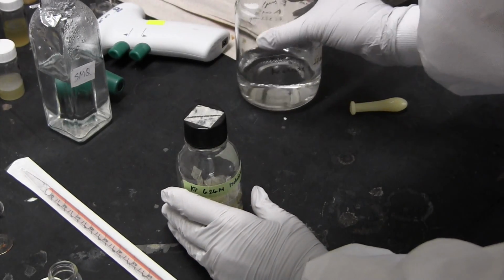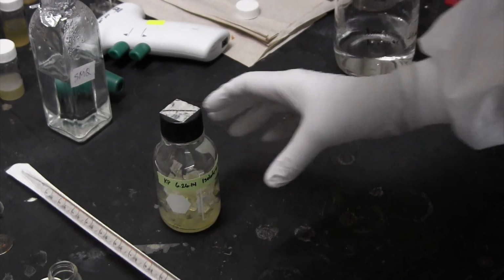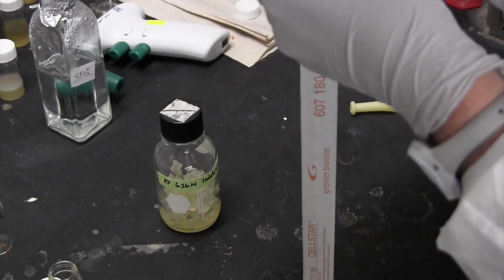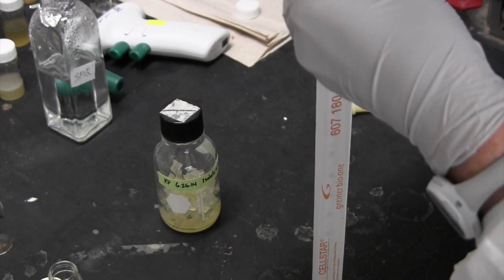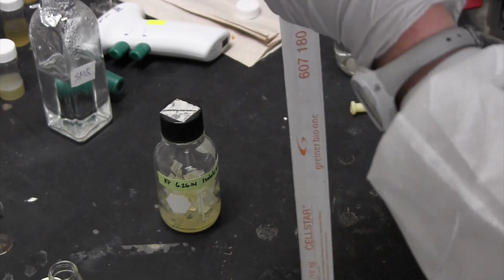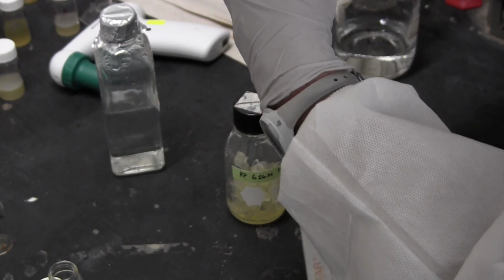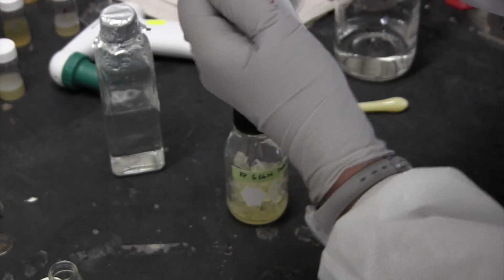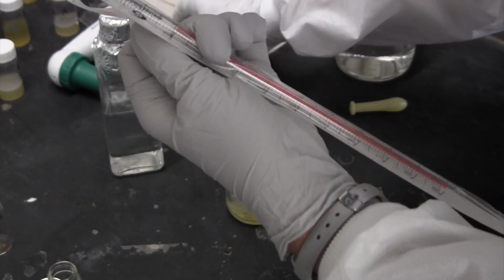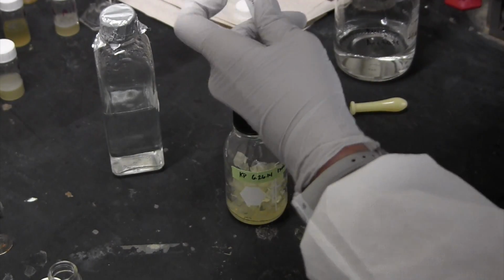Those of you who are chemists may or may not feel that this is necessary, but we think it helps the efficacy of the chemical extraction at this point. And then obviously you have 2 nice clear layers a couple steps down the road when we pull our extract off our agar. So I'm just going to use this sterile water that we have here, and I'm going to use a pipette to pull it up, and we're going to add 8 mL of sterilized water.